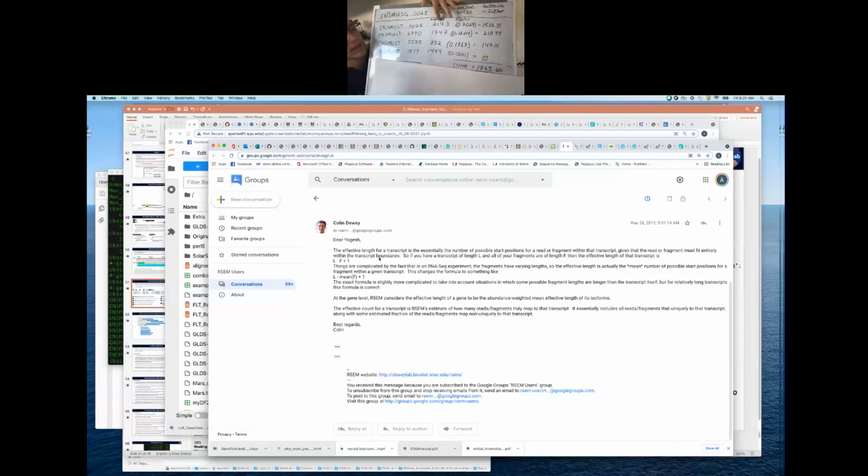So if you were to just take the average, like sum these up and divide by 4, you're not going to get this number. So yeah, sorry for the dings. It's a weighted average based on the data that you give.